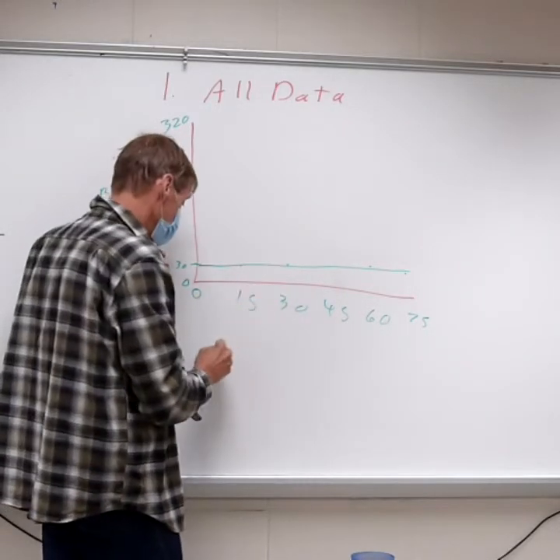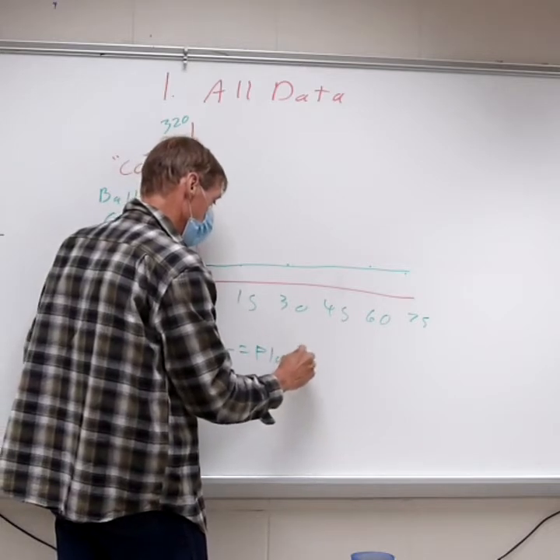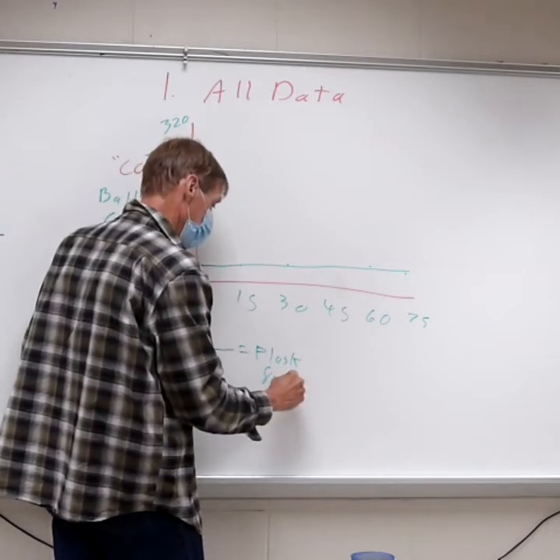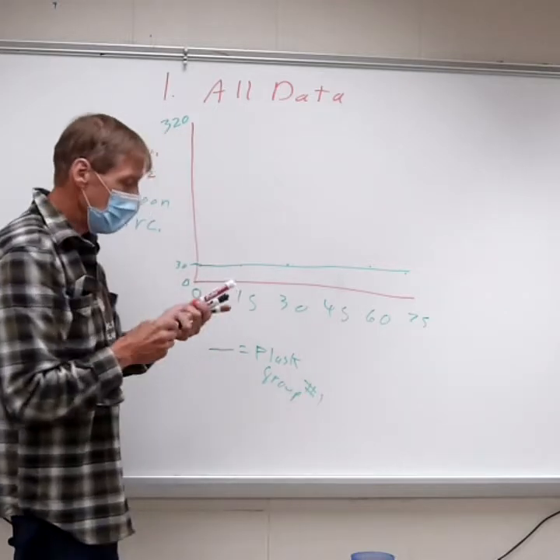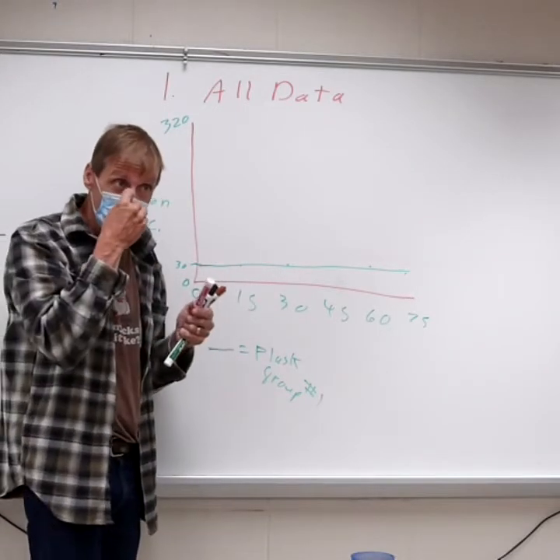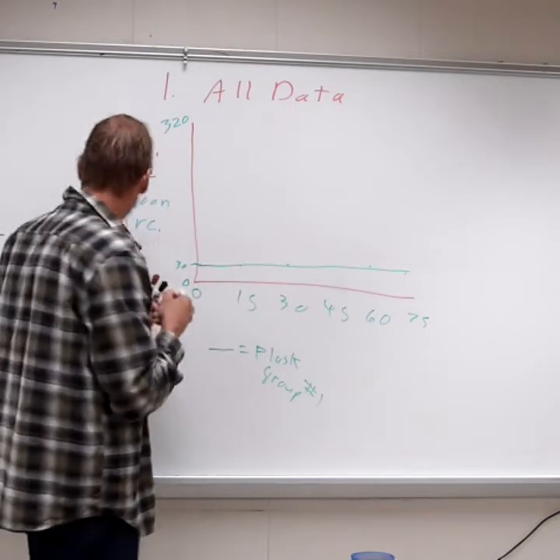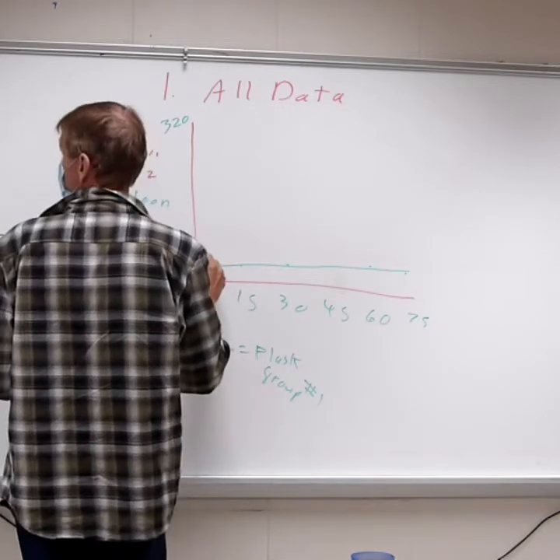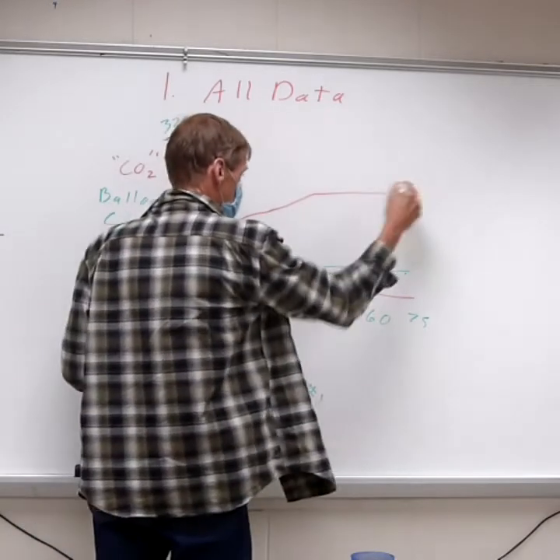And you need to code it. So green equals flask or group number one. Then you switch colors or pattern. You use dotted lines, dashed lines, thick lines, skinny lines, different colored lines. You have some other balloon, and it may start about 30, but I don't know what they did. It might go something like this.